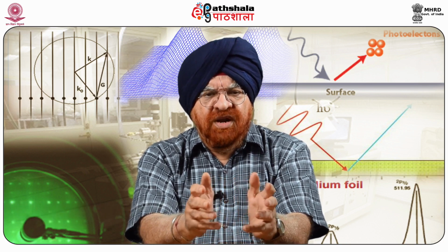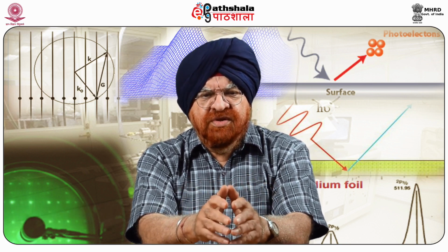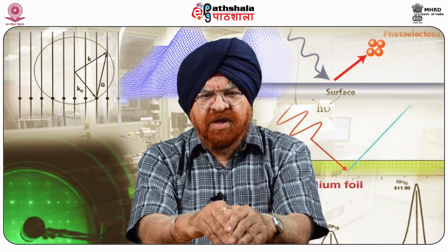Chemical force microscopy analyzes, of course, force and distance. When the tip is placed at a fixed point on the sample and moved in the vertical direction to the surface and then retracted from the surface in place of scanning, the deflection of the cantilever can be measured as it moves.